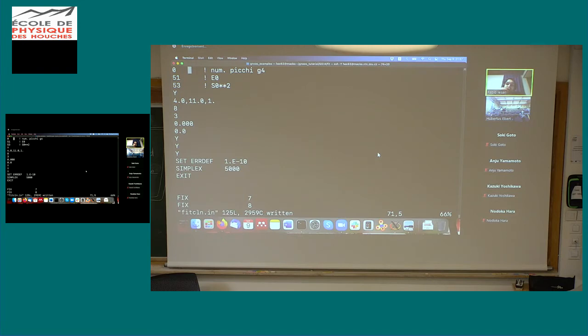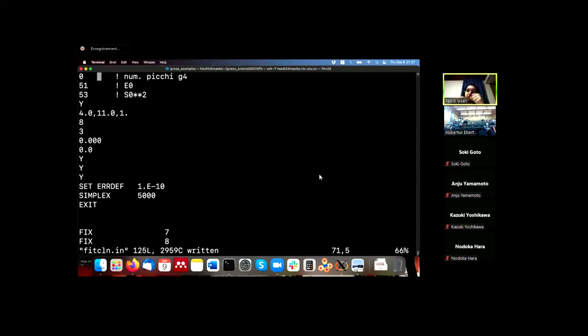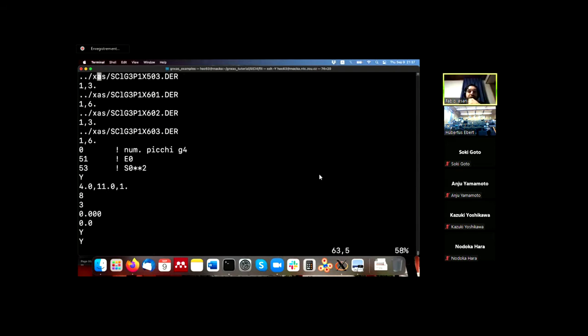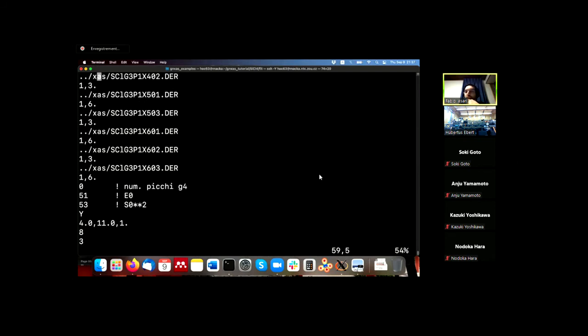But in the case that you use a real potential, then you need to put mean free path parameters. There is also the possibility to refine the mean free path with some linear model or some more complicated model. But in general, what I suggest is just to use the complex potential, and that is accurate enough. Okay, thanks.